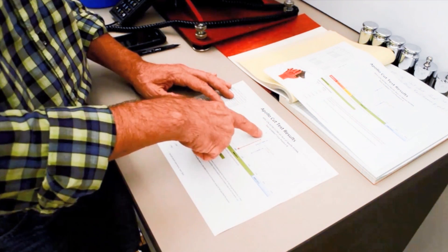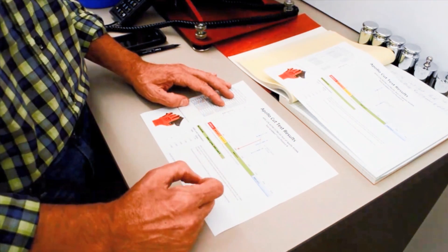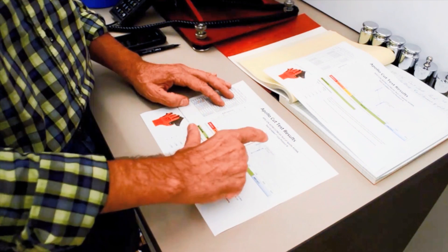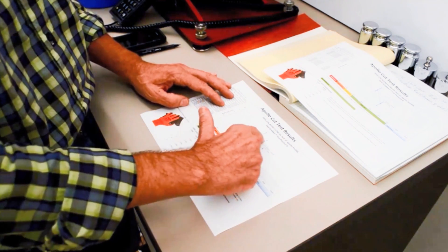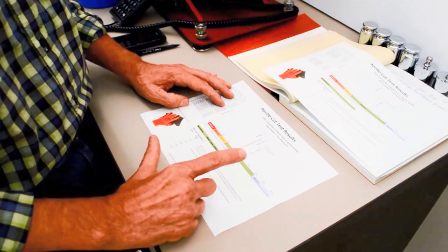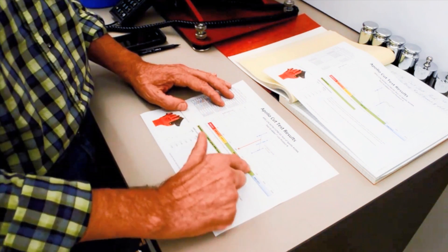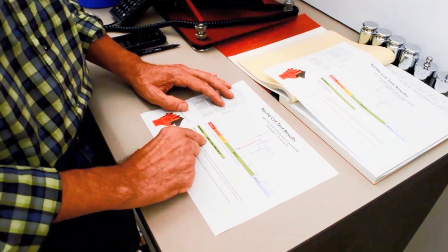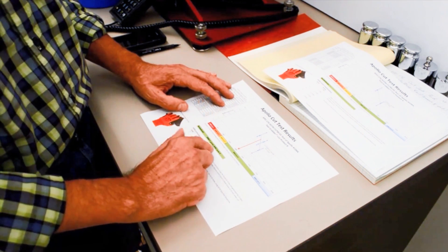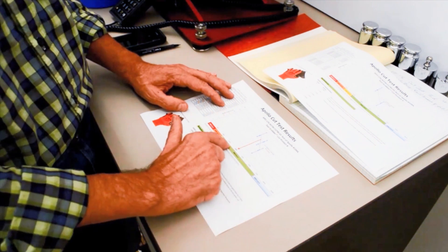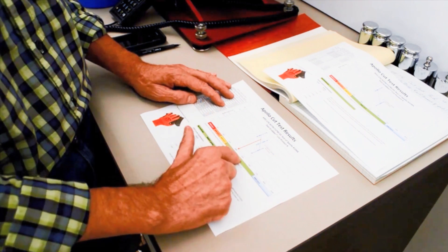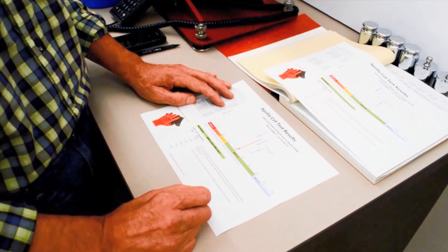We've done the ASTM test, we've graphed all of the 15 data points, we've calculated where 20 millimeters of blade travel crosses the line of the weights, and we come out with 2,009 grams, which is an ANSI cut level 4, well into the ANSI cut level 4 for an excellent cut level 4 rating.